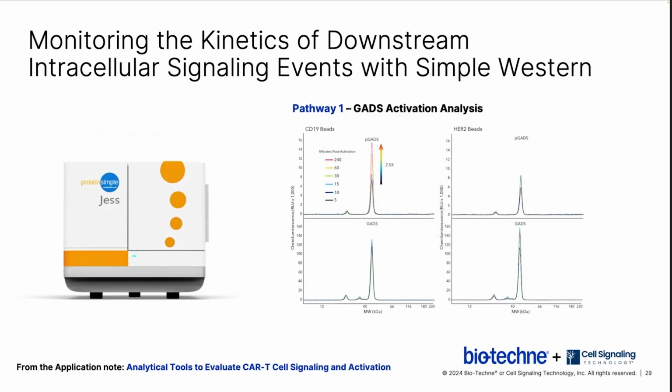Shown on this slide is an example of the Simple Western data we obtained for the first pathway using the CD19 CAR activation time course samples. We analyzed whole cell lysates on the Simple Western platform using specific antibodies targeting phospho and total protein isoforms of central T-cell signaling molecules, including GADs, phospho-GADs, SLP76 and phospho-SLP76, ERK, and phospho-ERK.